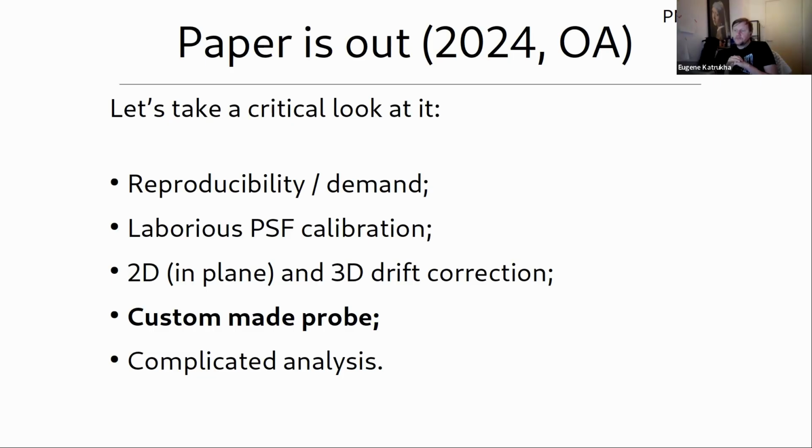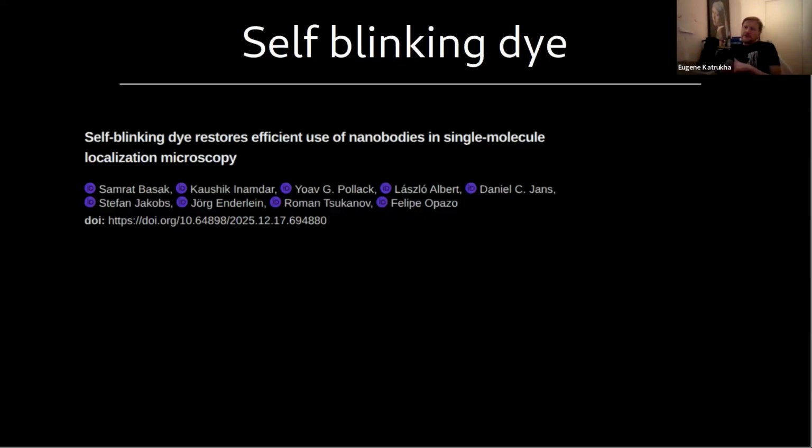But one of the lazier things, and I really like lazy science and simple things that work, that I discovered recently and actually tried a couple of weeks ago, was a preprint from a couple of groups where they found one of the Janelia dyes which blinks on its own, and it blinks in water solution.